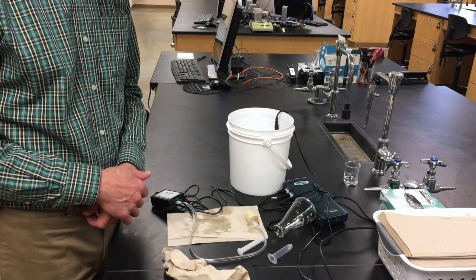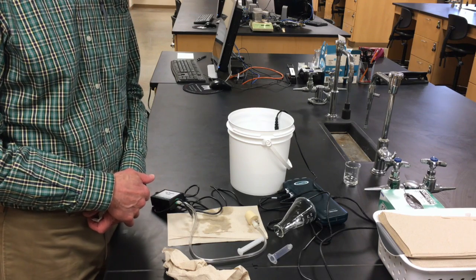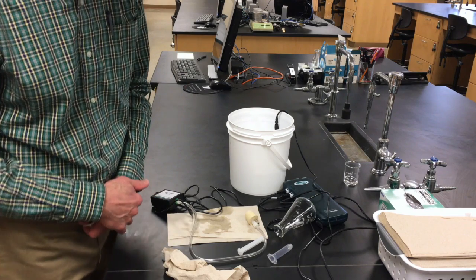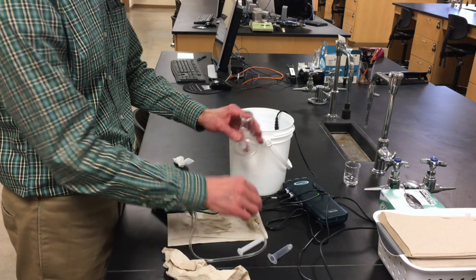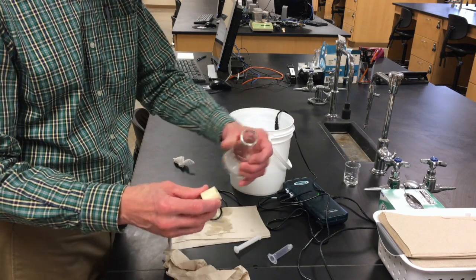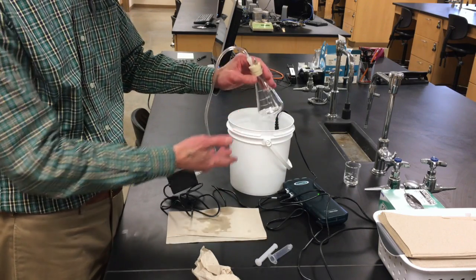You will get excellent data for your second liquid, and if you do that between the second and third, you'll get great data on your third liquid. And the last liquid is hexane. Let me say something about hexane, the last liquid. You're going to put it together just like we did before. You're going to measure the atmospheric pressure. So without the syringe, with this properly put together with a little water on the outside of that, squeezed together, you're going to put it in without the syringe and measure the atmospheric pressure.